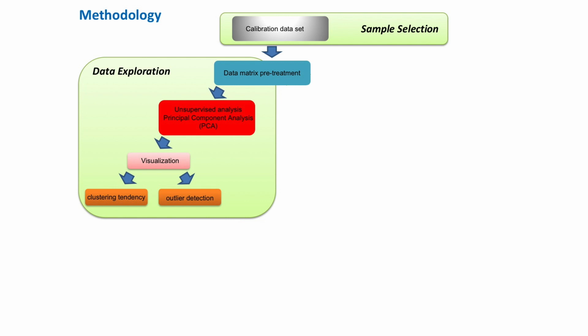What we will do also, in the spectra, is that every wavelength is not necessary and not usable. For example, in the spectra, there is a big part of noise due to the interaction with the water, and it's a very noisy part. And in this pre-treatment step, we put away this noisy part. How did you determine the threshold itself? I saw in one of the graphs a kind of horizontal line, and I took it as a threshold. It's a zero. It's an absorbance. It depends on the apparatus. Sometimes it gives to us the transmission and sometimes the absorbance. But the lower part is zero and the upper part is 100.